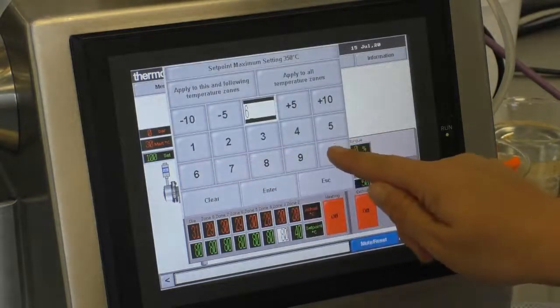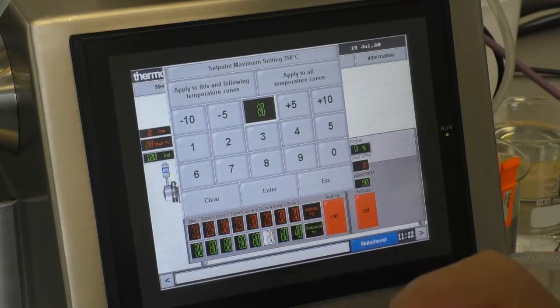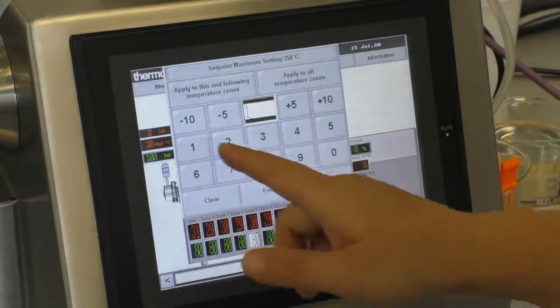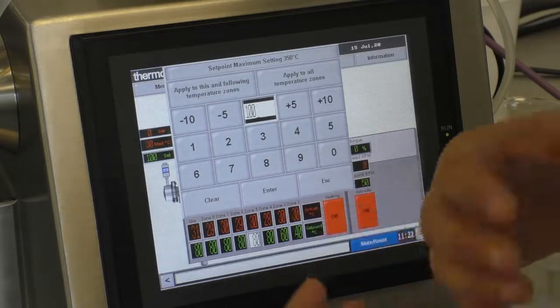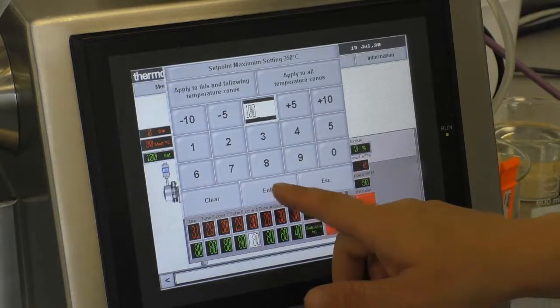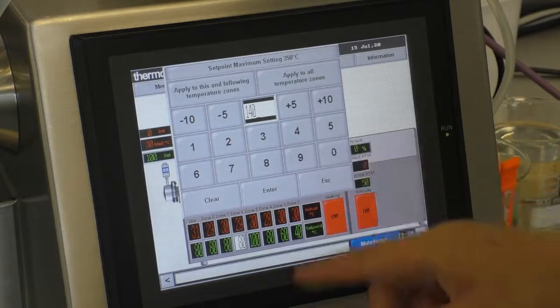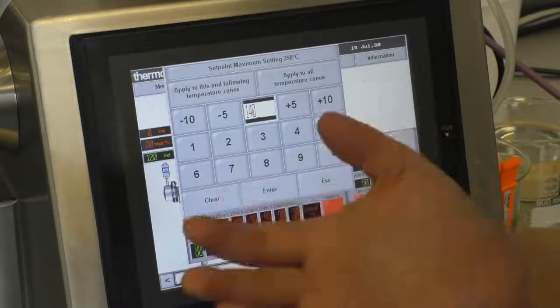Then we start increasing the temperature, and when I go on enter, I go towards zone 4. Here in zone 4 I will start going up to 80 degrees, so I keep this temperature. And then I will go to 100 degrees, because we want to make sure that the material undergoes certain molecular changes, and for this we need a high temperature. And then for the rest of the extruder I will set the temperature to 140 degrees Celsius, which is a temperature that we know for this material works very well and gives us a product structure that looks like a muscle meat-like product.